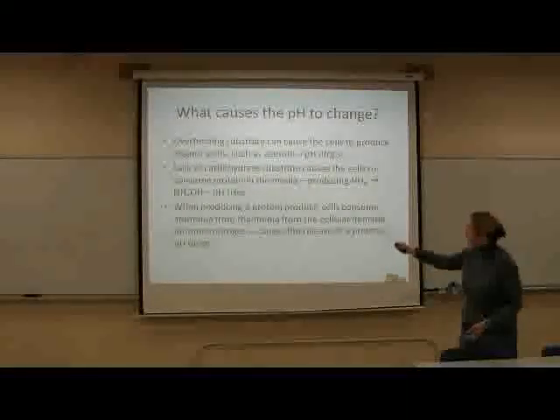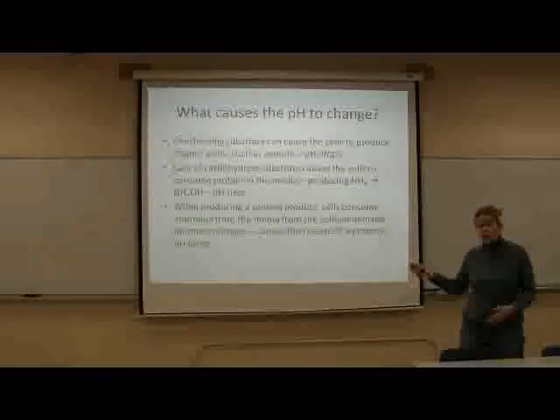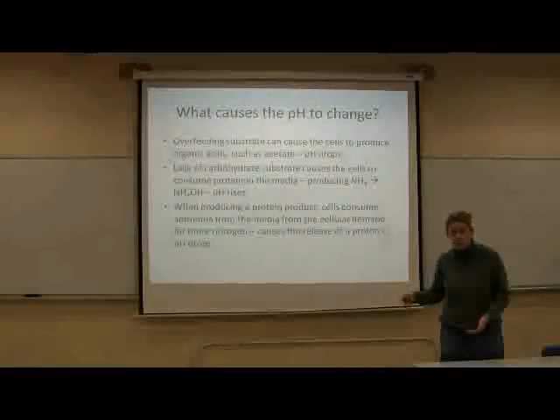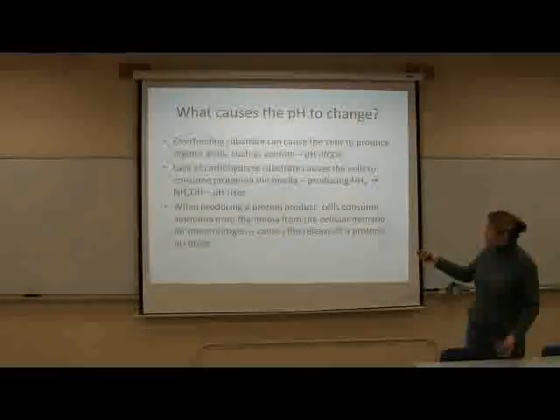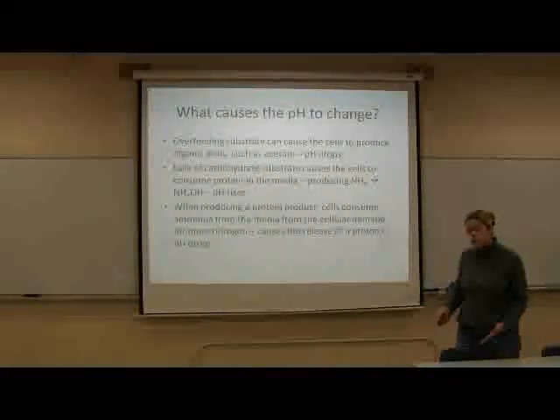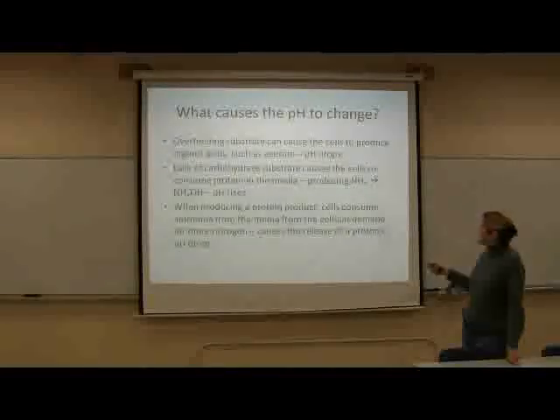If the bug runs out of food, if it runs out of glucose, so this one here could happen from too much food. This is what happens with too little glucose food, carbohydrates. Bugs are into carbs. So if you don't give them enough carbs, they're going to take the protein, kind of like humans, except we humans kind of like protein. If you don't give it enough carbohydrates, it'll switch and start taking in protein for its sustenance. And as a result, it's going to produce ammonia and amines, which are nitrogenous, and then the pH will rise.